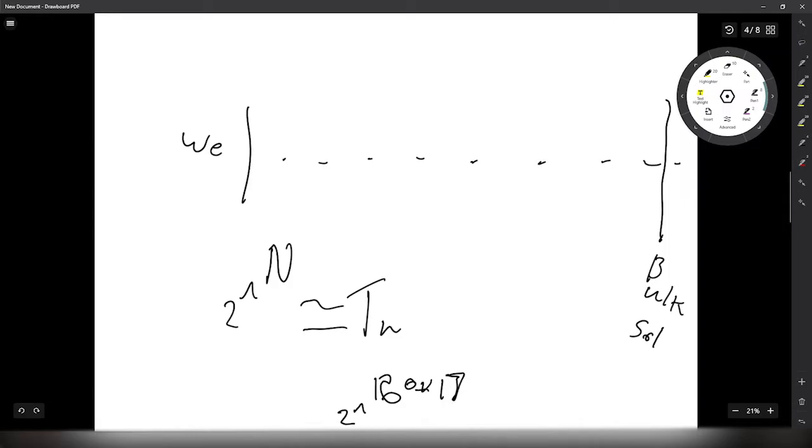But it's important to remember that in modeling all these time points, if you decrease the number of time points, you're going to get less accuracy, but the amount of time required to do all the calculations is going to halve. And it's very much a balancing act of, do we need the added accuracy? And if not, can we reduce it?